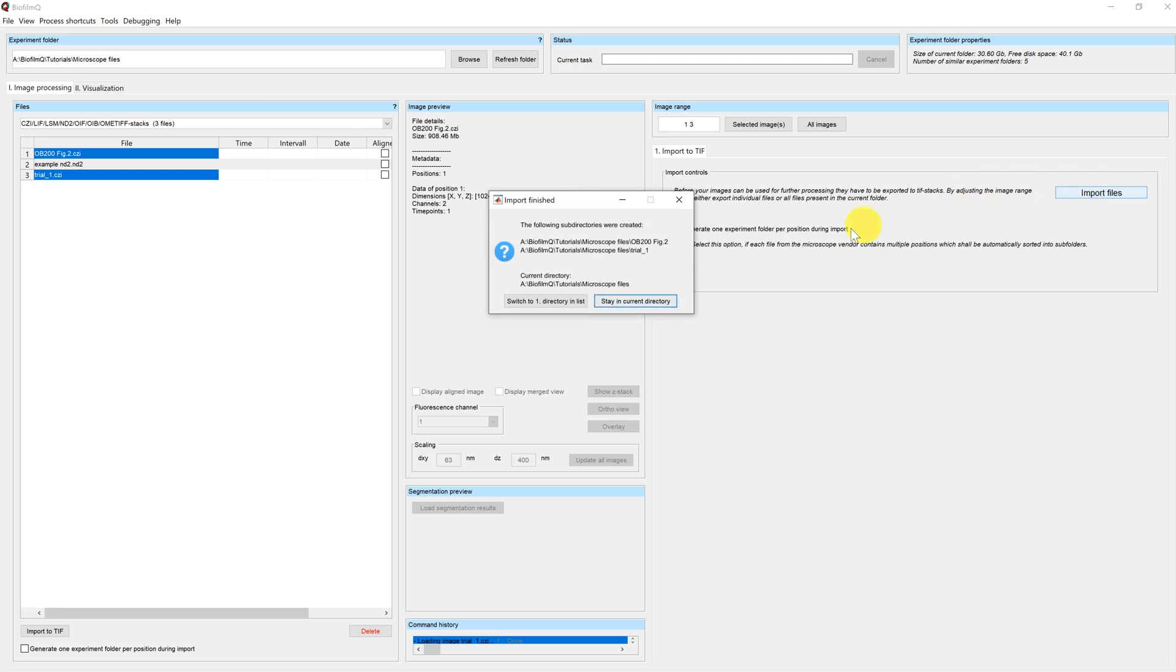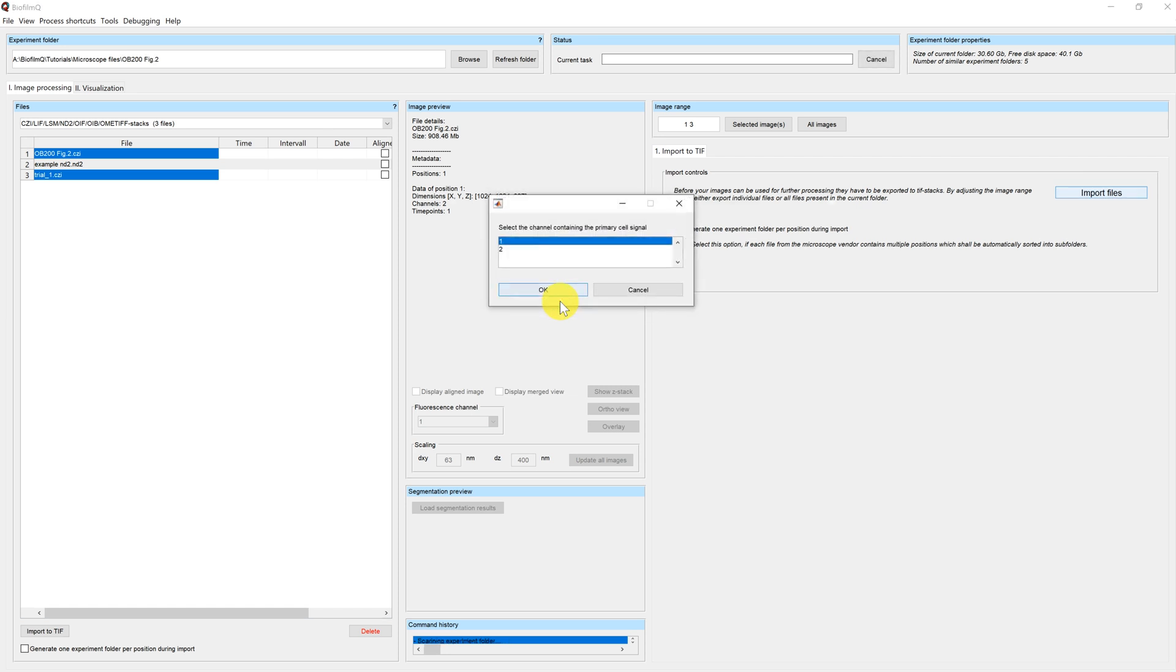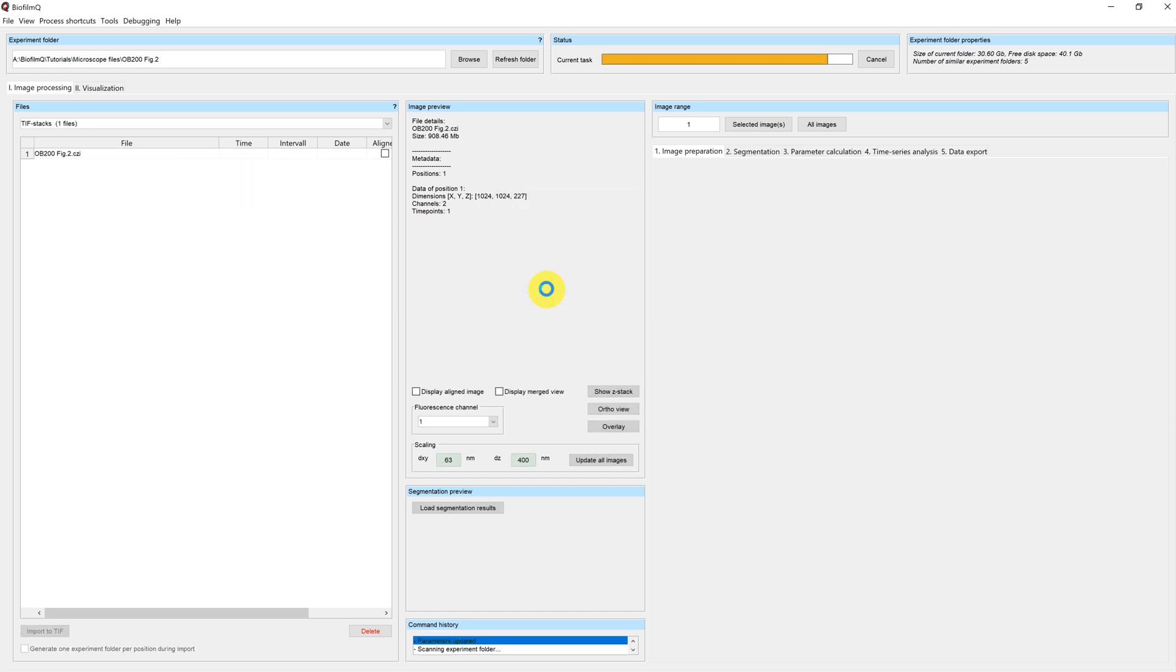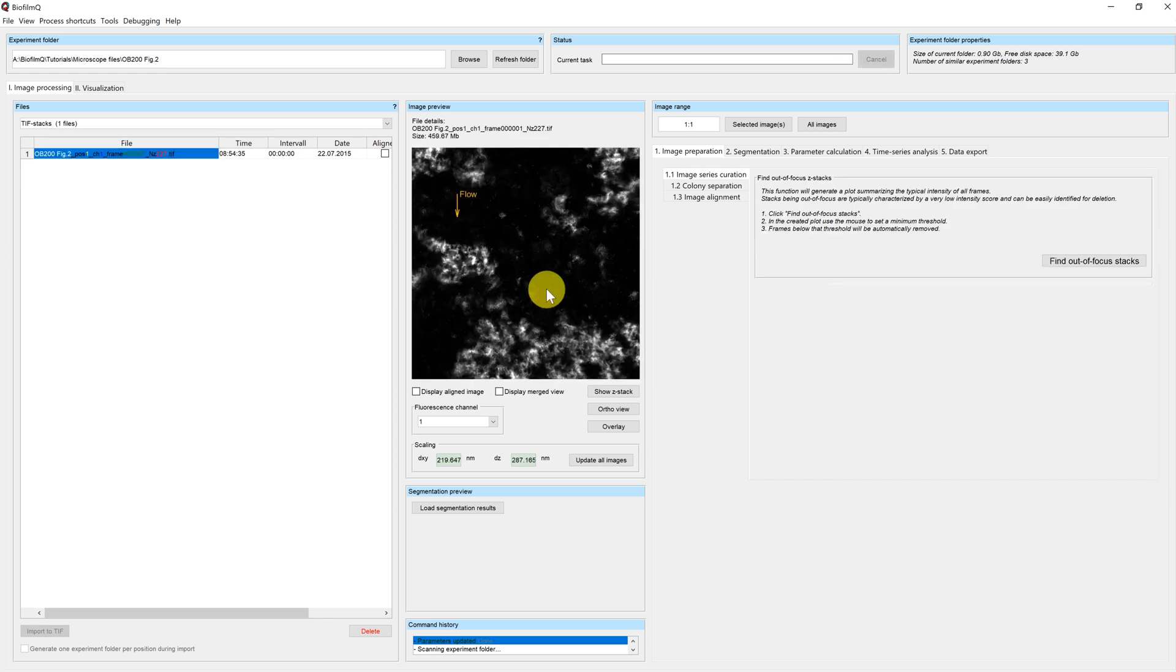Again, we can switch directory or stay in the same one. In this case we want to switch because our import is complete. And you can see that there is another pop-up that asks for the channel containing the primary cell signal. In our case this would be the first channel.